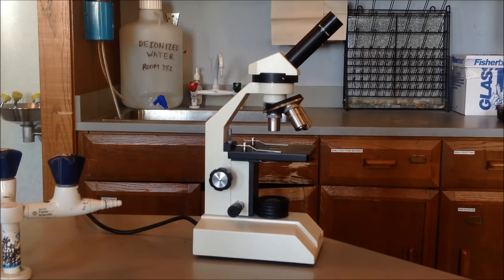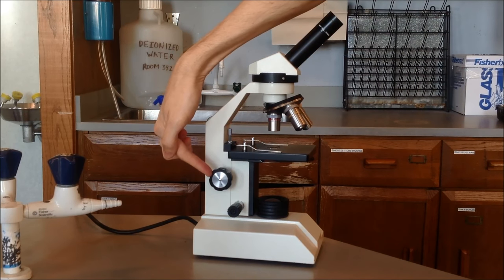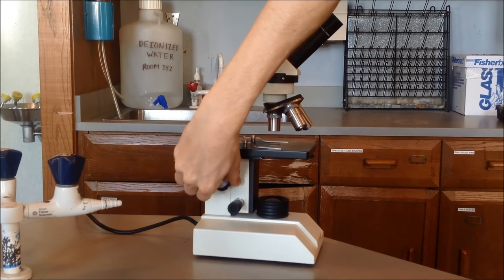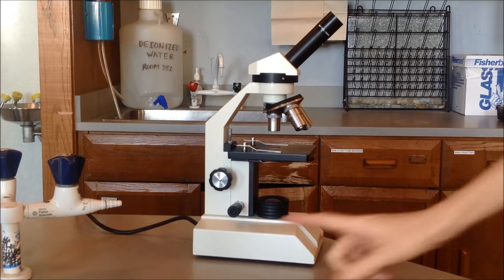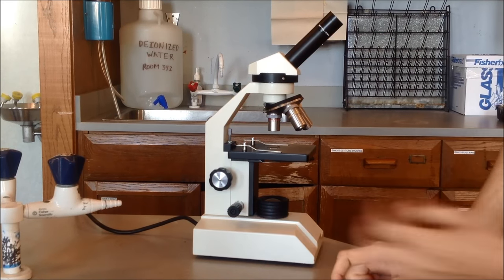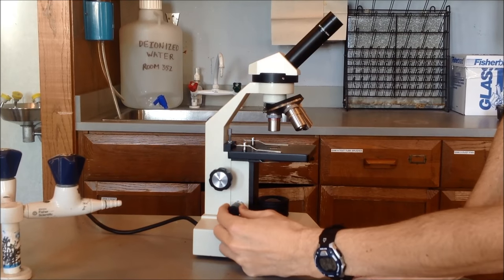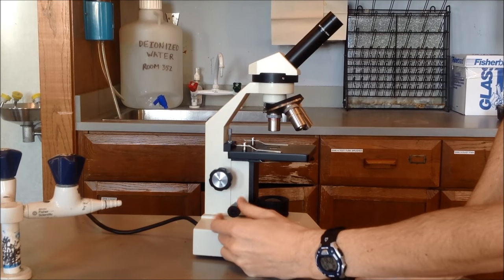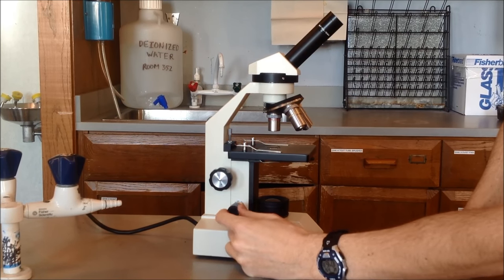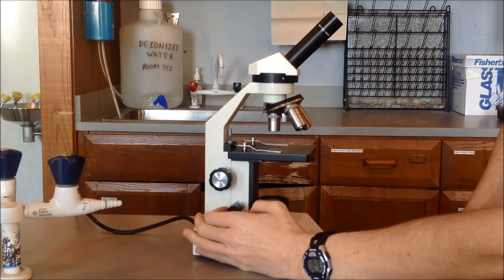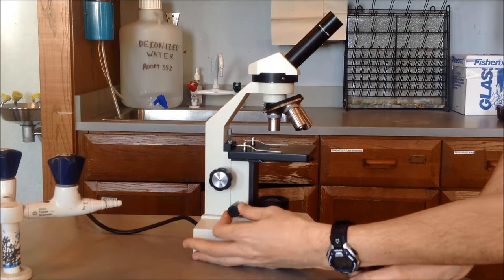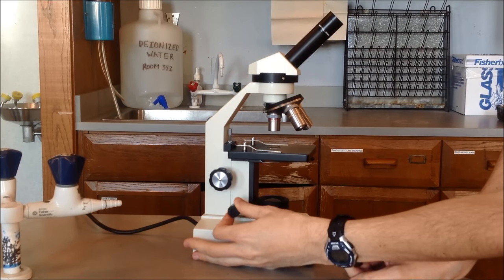And then you have the coarse adjustment. It's going to be the large knob here, which you can see moves the stage like so. And then the fine adjustment is going to be this one right here. And the fine adjustment does the same thing as the coarse adjustment, except it doesn't move the stage as much. So the coarse adjustment moves the stage a lot in very small amounts of turning. And the fine adjustment moves the stage in very small amounts.